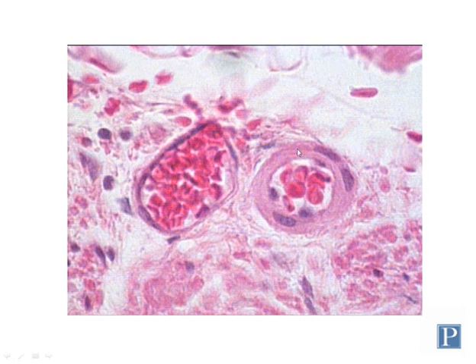The arteriole here has several layers of smooth muscle in one of the layers, which is known as the tunica media of this blood vessel, and so this dark red tissue here is the smooth muscle. Arteries and arterioles have more muscular walls than associated venules and veins, and that's why they help to maintain their shape a lot better.